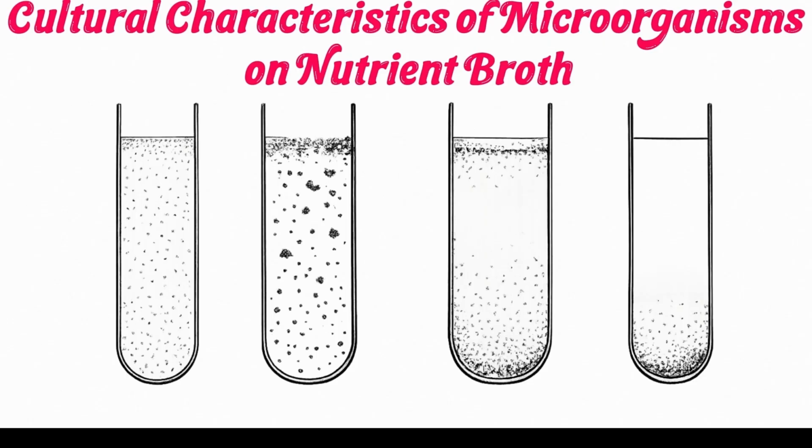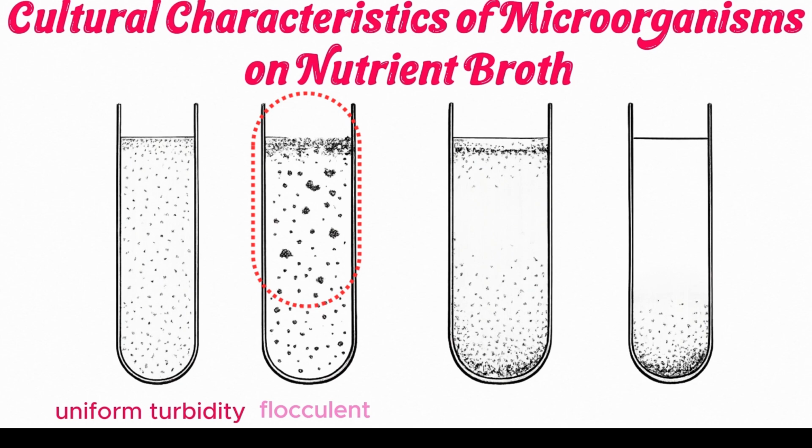Uniform fine turbidity. The word turbidity means cloudiness. Uniform fine turbidity indicates bacteria are evenly dispersed throughout the broth. Flocculent. Flocculent comes from a word meaning flakes of wool. Cells aggregate into floating clumps throughout the broth.